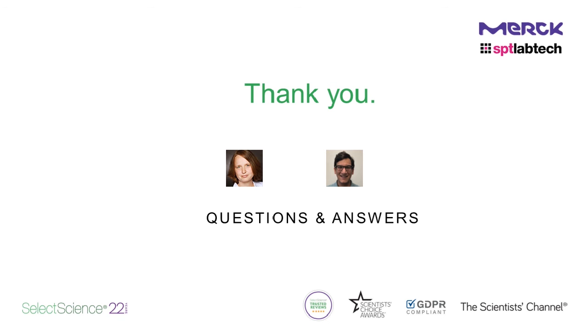Perfect, thank you, Nina. Okay, the next question we've got is, can assays done on the dragonfly be performed on liquid handlers as well? Yes. Of course, there are different liquid handlers out there. We have a couple of different ones here in our labs, also small benchtop devices, and each of these benchtop devices has its pros and cons.